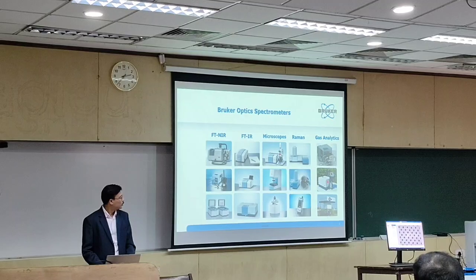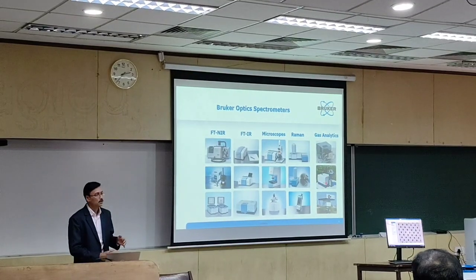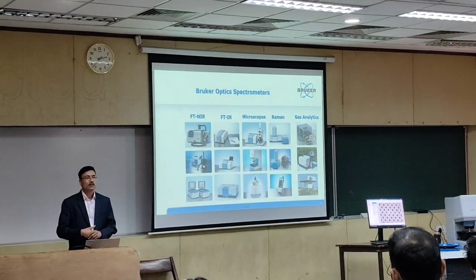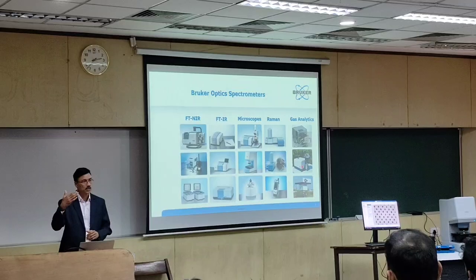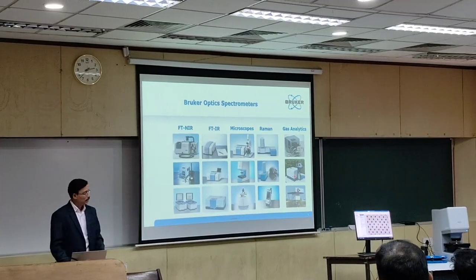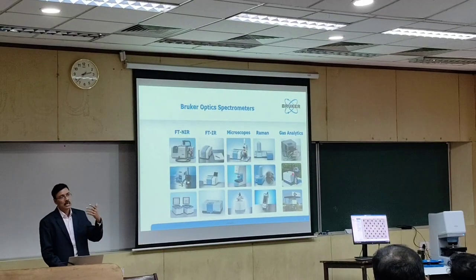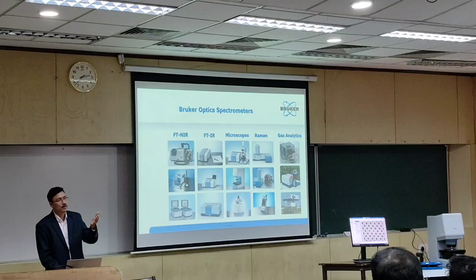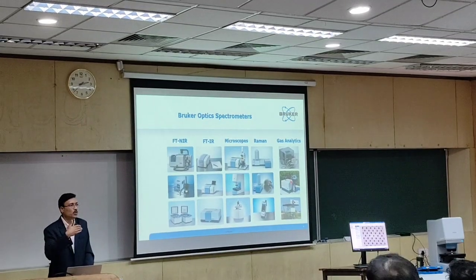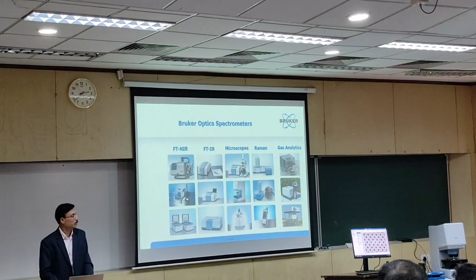And then the second one which you see is called a remote sensing system. This kind of system we can keep, for example, here, and record the data from 500 meters to 10 kilometer distance. Whatever gases are getting released at 10 kilometer distance, we can also analyze using this system. There are gas explosions, or sometimes in industrial areas different gases are getting released. If you want to see which gases are releasing and what the concentration is, you can do this measurement from a long distance.